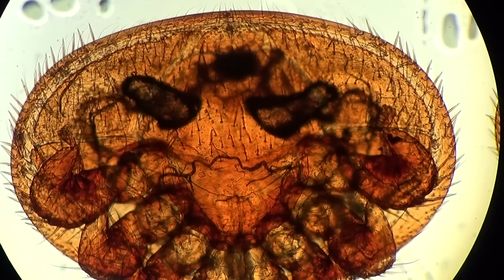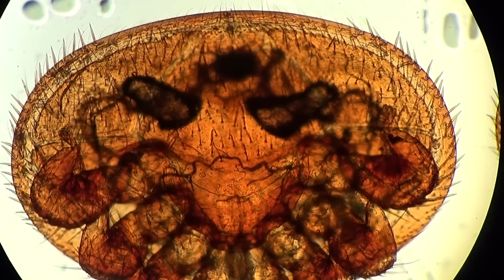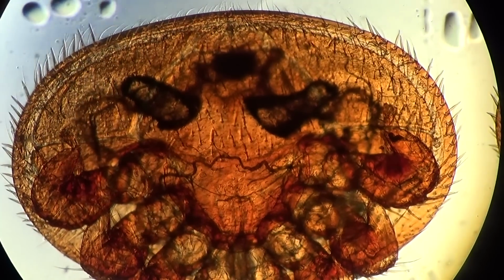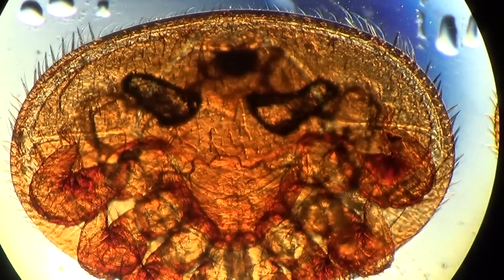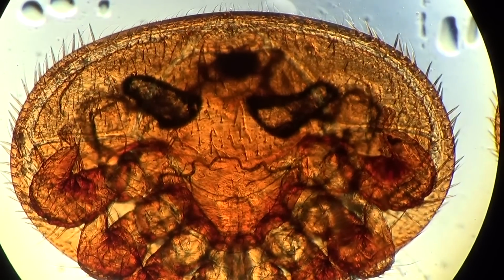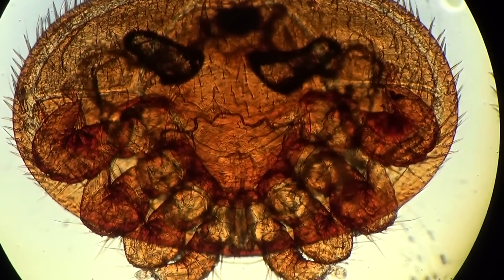So probably some mites can be transferred from one insect to another on some other pollinators, insects like wasps and some flower flies. And actually this bee parasite is very dangerous, because this is a blood-sucking parasite which is feeding on the hemolymph or blood of the honeybee.